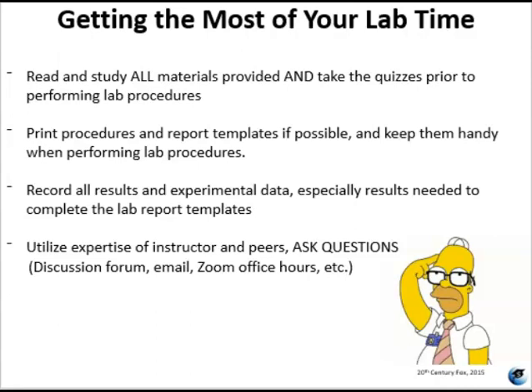Okay. If you can, you're going to want to print your procedures and the report templates beforehand so that you can keep them handy when you're performing your lab procedures. If you can't print them, that's okay. I recommend making detailed notes beforehand, though. You can have a laptop in your home kitchen lab, but I don't recommend it because sometimes things can get kind of messy. You don't want to mess up your laptop or possibly contaminate it.